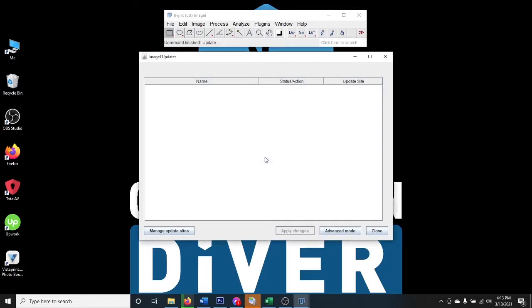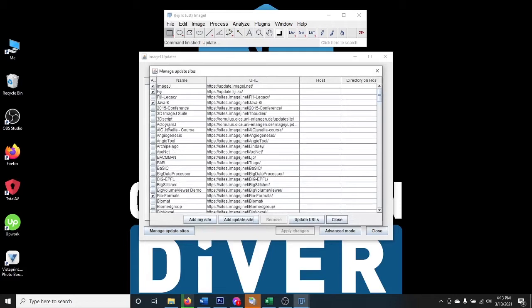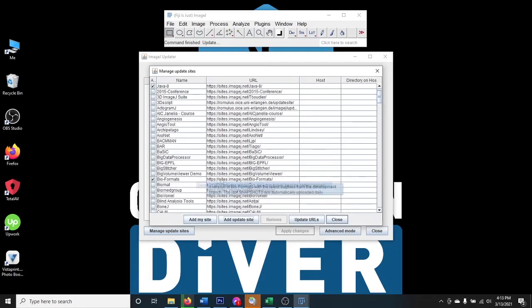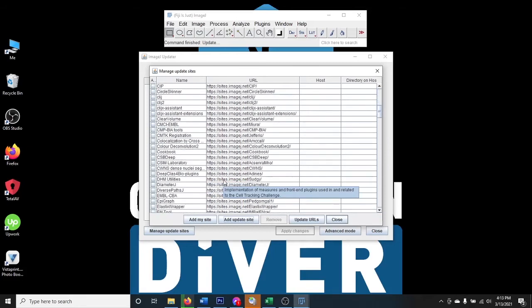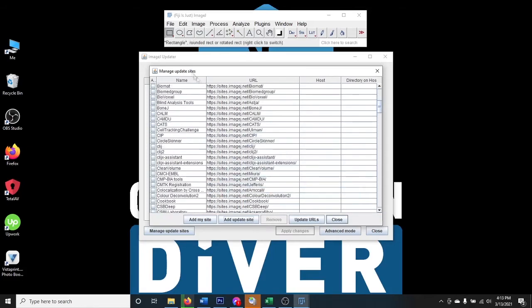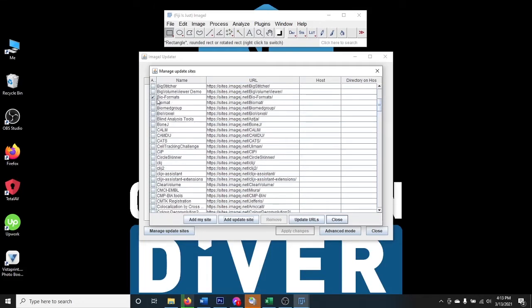You can find more features by going to Manage Update Sites, where you have choices for different plugins you can add depending on what you need. All you need to do is check it and click 'Add to My Site' to get other packages. If you're following tutorials and they're using tools you don't have, this is how you can add them.